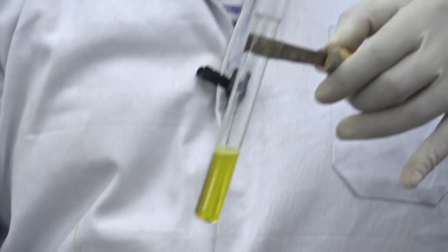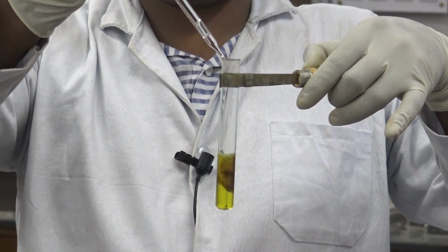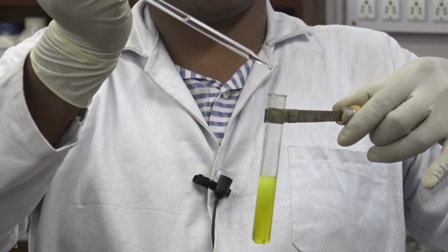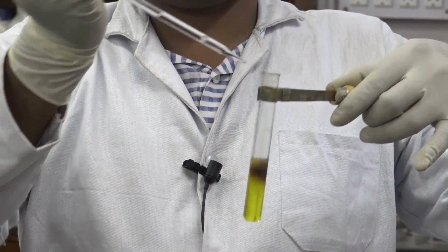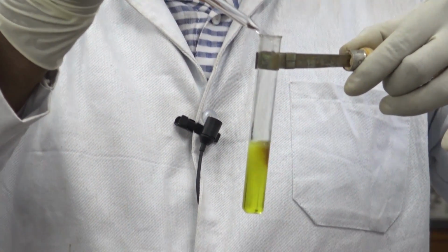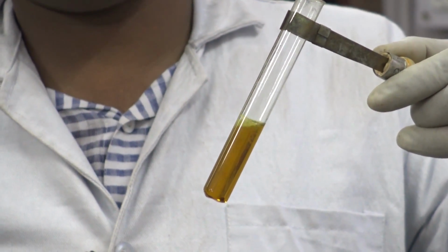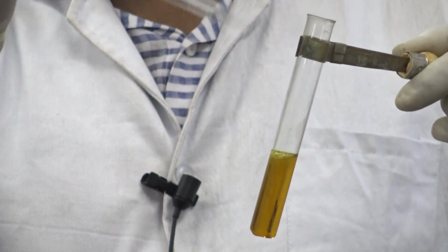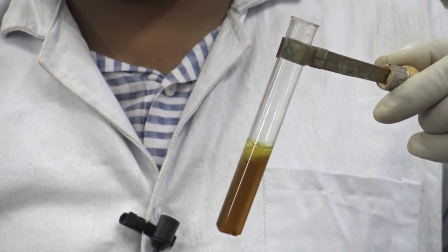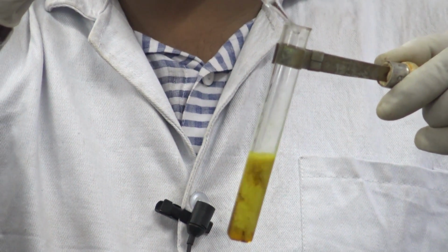Now, acidify the reaction mixture using acetic acid. Then add lead acetate solution into it.